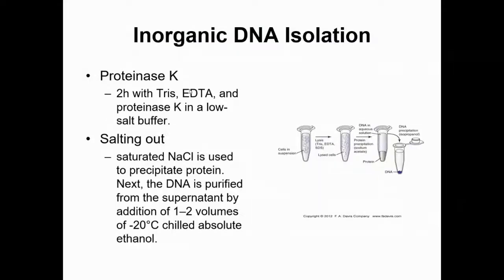For the inorganic technique, right? So the inorganic method involves the incubation of the nuclei with the proteinase K, all right? The proteinase K basically will digest all the protein at 65 degrees for 2 hours, okay? Because the proteinase K is more active and denatures the protein, and also after prolonged incubation at 65 degrees can be auto-inactivated, all right? So then following incubation for more than 2 hours with the proteinase K in the low-salt buffer, the extracted DNA can be used directly for diagnostic analysis without any additional purification, all right? So basically that's proteinase K.